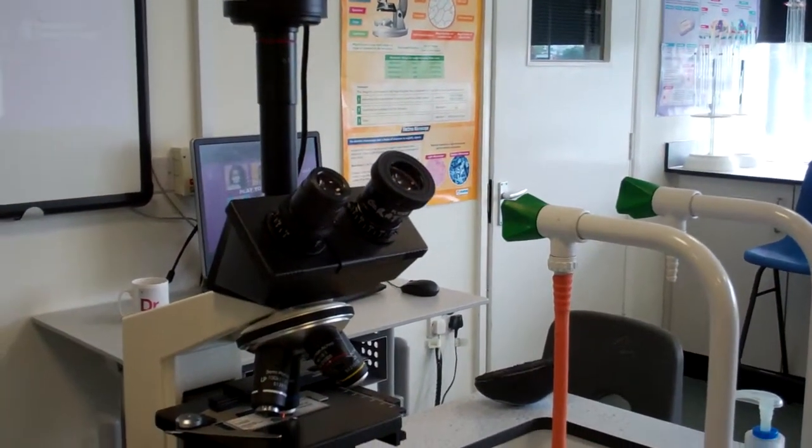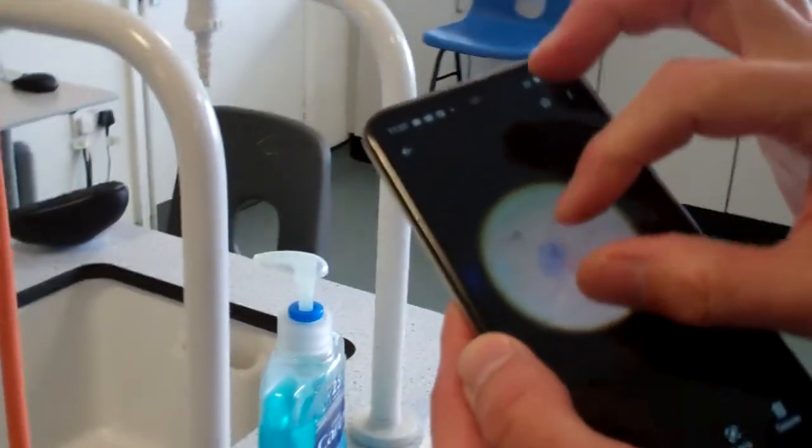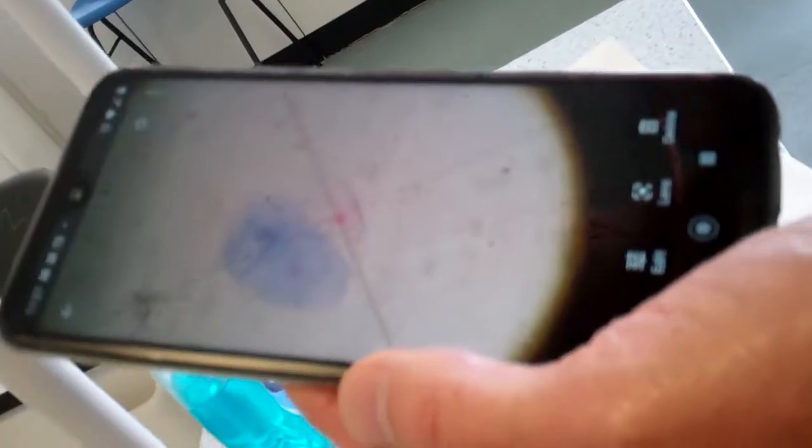Now, here's a photograph I took a minute ago. I just make it a little bit bigger. So you can move the slide around, but if you notice, I've got this pink slide here, and I've lined it up so it's going from 40 to 66. So that's basically 26 eyepiece divisions, from there to there.